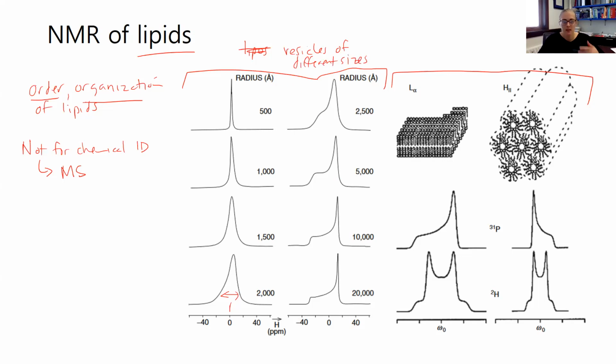So you can imagine, this is a model study of vesicles of one type of lipid, but you can think even if you have a more complex sample where you're trying to understand maybe self-assembly of different mixtures of lipids, or if you're able to extract organelles or cells somehow, you can get at, okay, the width of this relates to the size, and the heterogeneity would relate to the different peaks that are present.